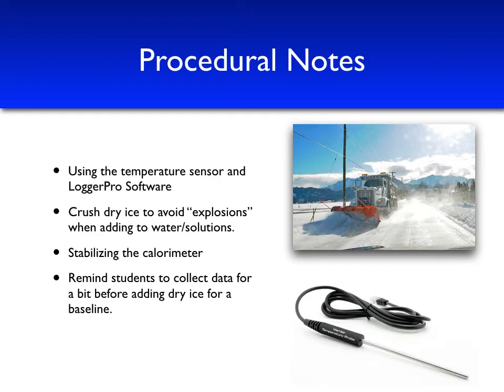Here are a few procedural notes for this experiment. More will be discussed in the lab video. In this experiment, we'll be using the temperature sensor and LoggerPro software. You can look at Appendix C to see how the temperature sensor and LoggerPro software work.